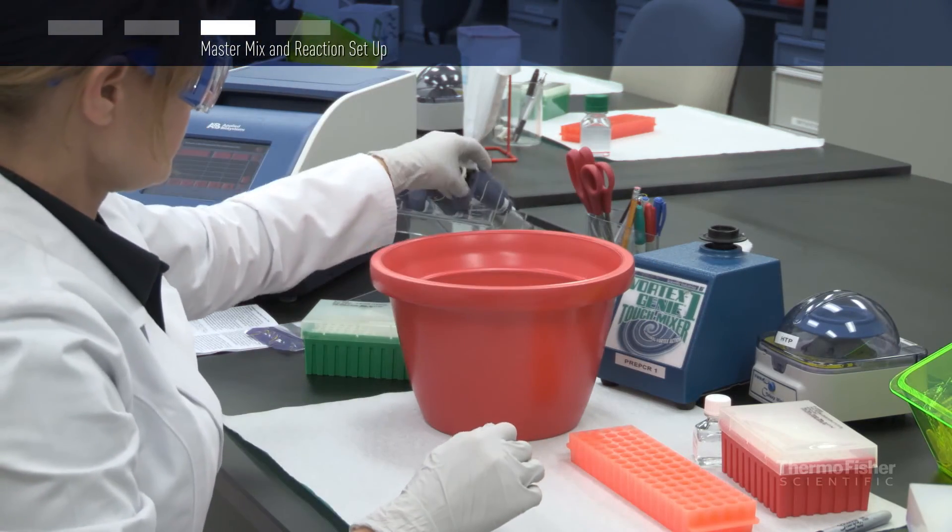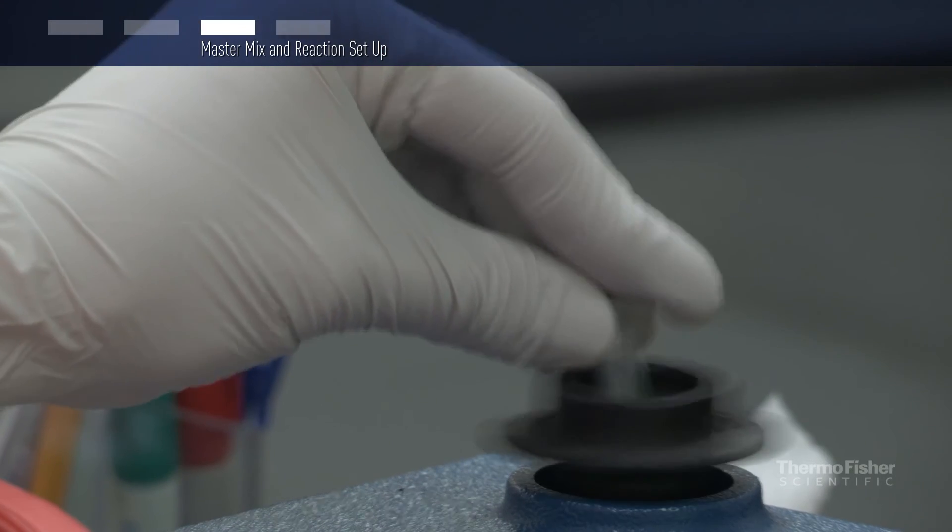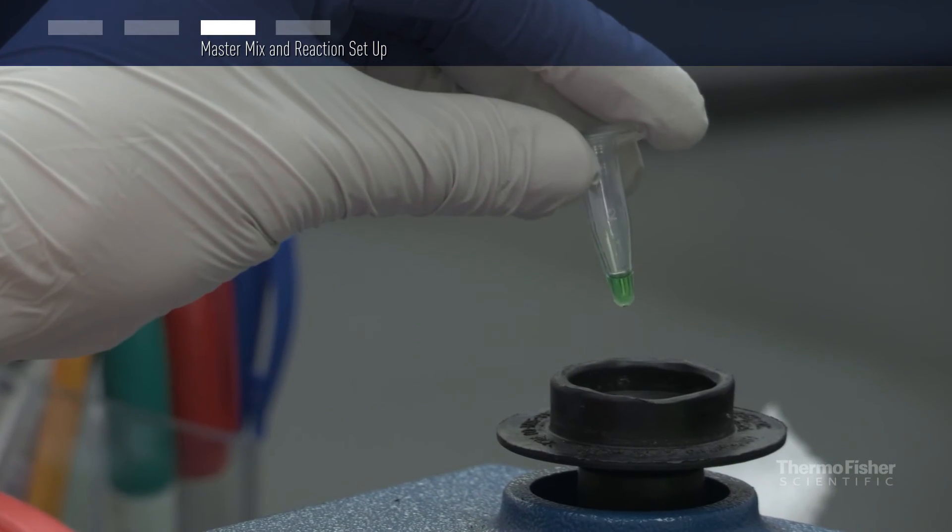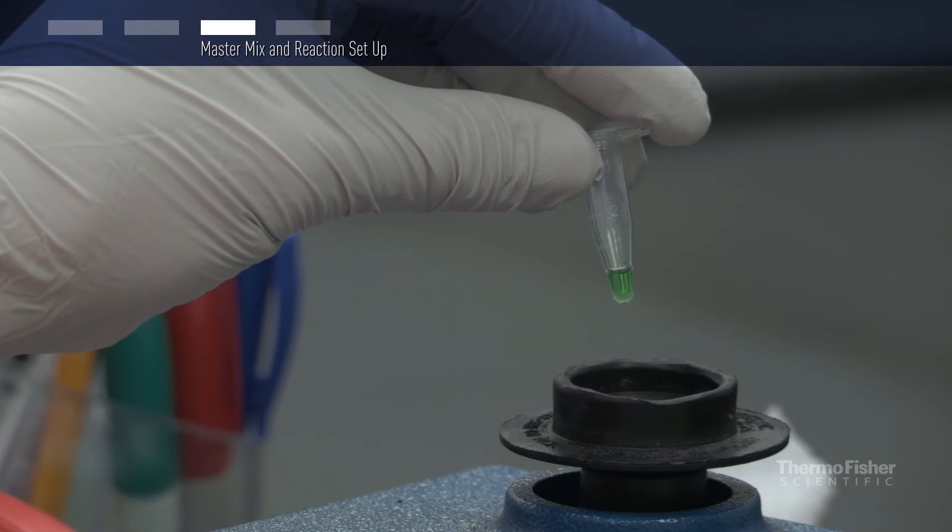Keep the reaction tube on ice to improve specificity. If a hot start version of the Fusion polymerase is used, then the reaction can be set up at room temperature.